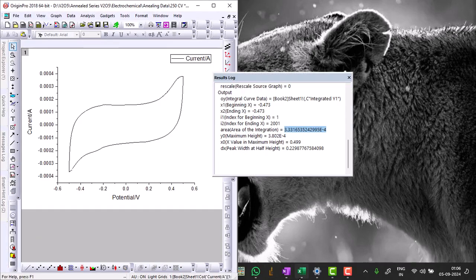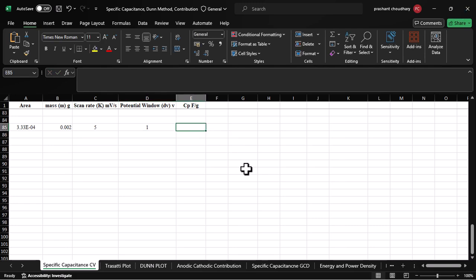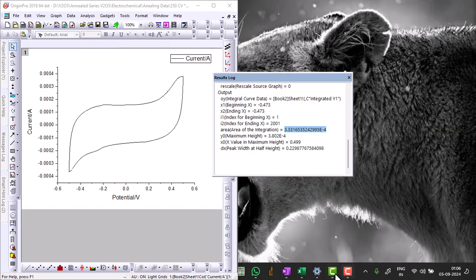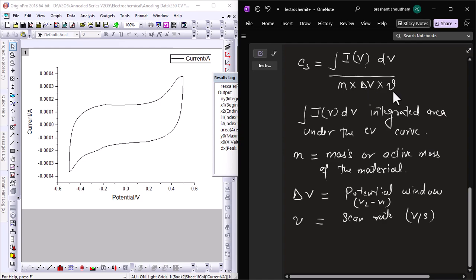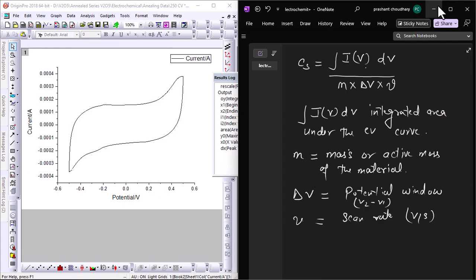For the calculation of specific capacitance, when we derive the formula, we have everything: the integrated area divided by active mass, multiplied by the potential window and scan rate. I'm going to use this formula to calculate specific capacitance.